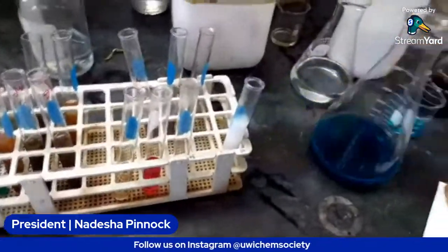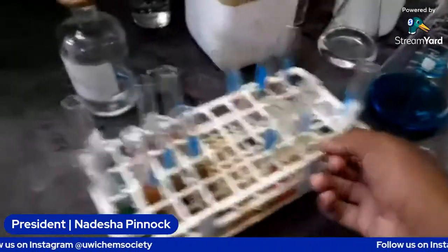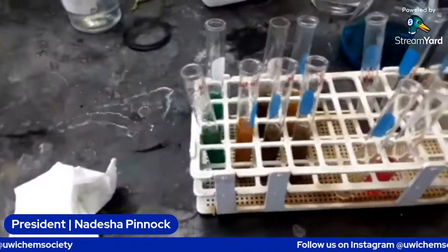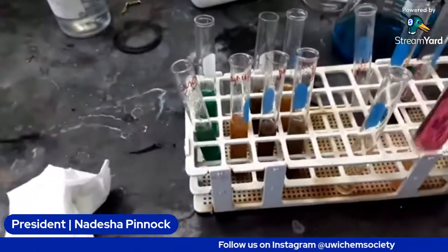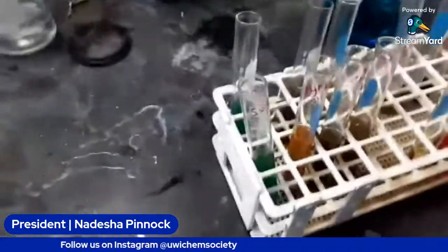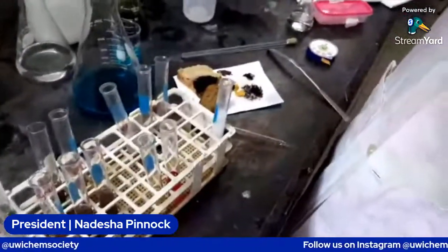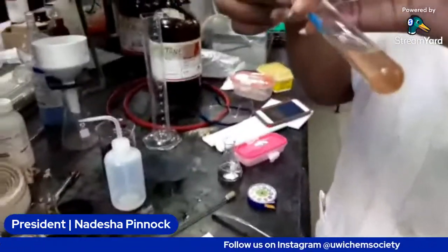So we're just going to take off a piece of it and test the pH of each of the solutions. Then add some sodium carbonate, bicarbonate, and see when it gets neutralized.